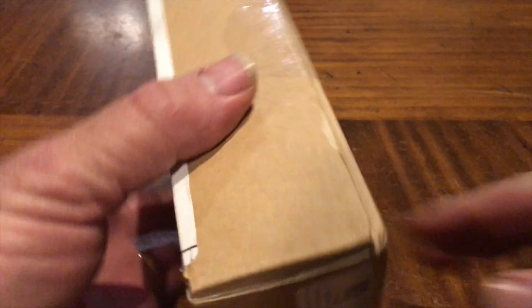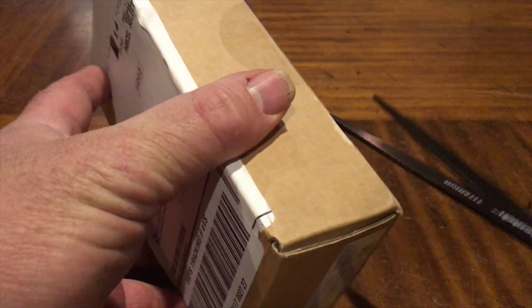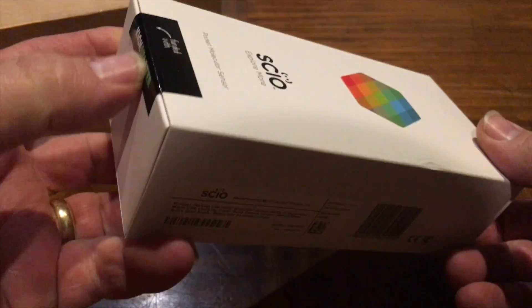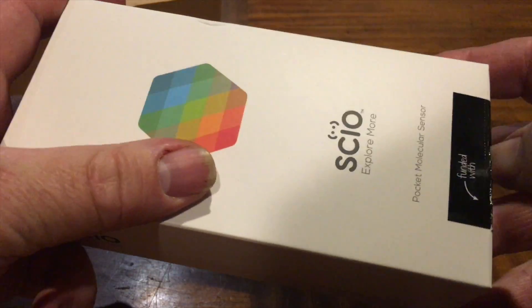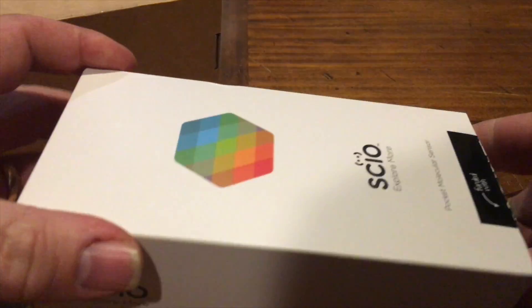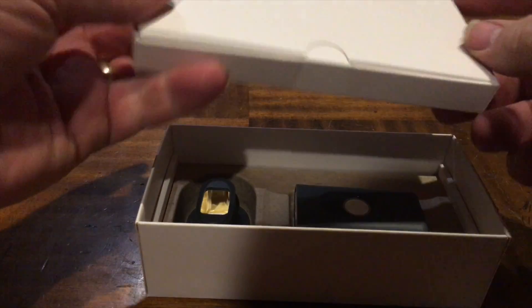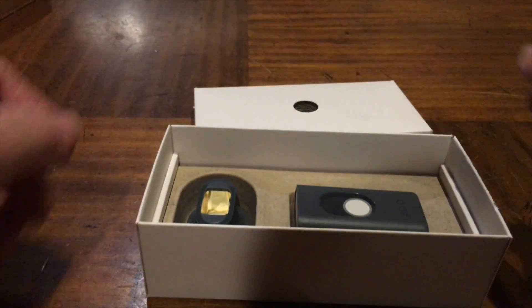I just got my Sayo - it came in the mail today and I wanted to do an unboxing video. It's Kickstarter funded and I've been waiting a long time for this little baby. We'll see what's in here in a second.